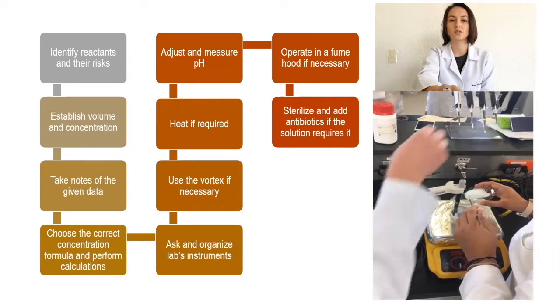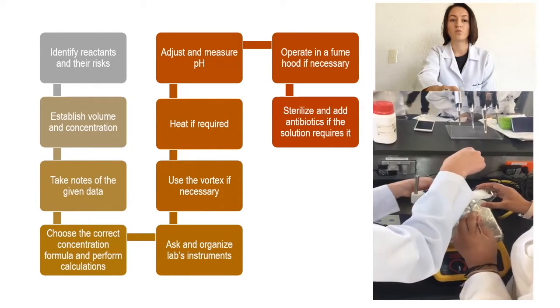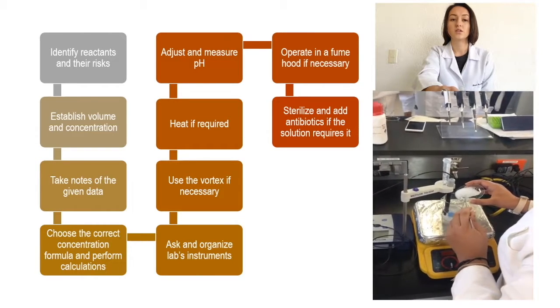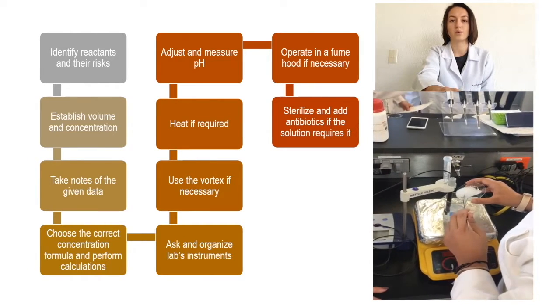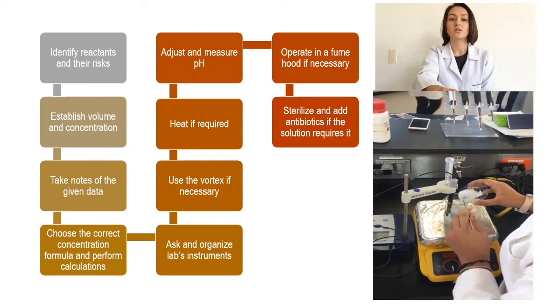After so, you can proceed to weigh and measure. Don't forget to properly label the solution. If it requires to be sterile, then cover the top with cotton or craft paper and use a glass container with lid and consider that the volume might increase.